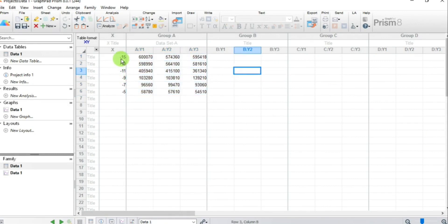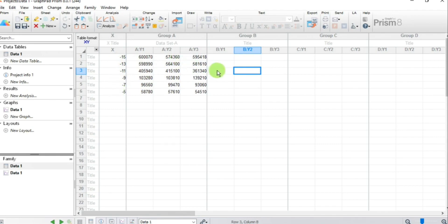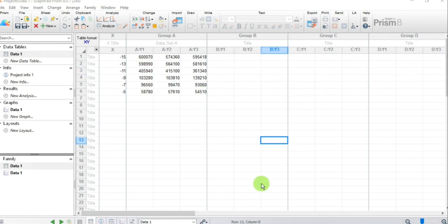Go back to Prism, right-click, and paste the data. Against each concentration you now have data in triplicate. These will be plotted on the Y axis as our response, with concentrations on the X axis. If we had more agonists, we could plot additional data in the other columns and get multiple curves. Now let's go back to Excel and copy the stimulant compound values.